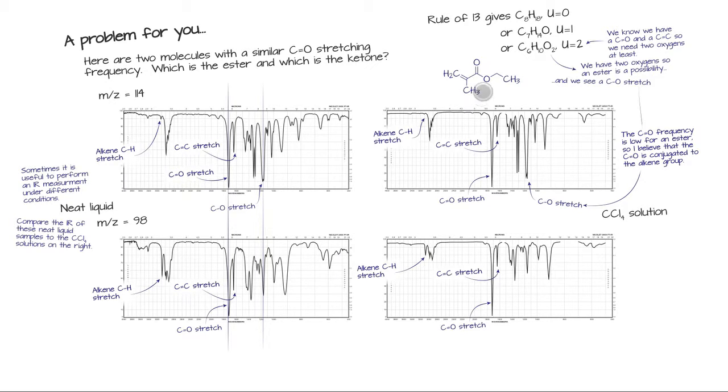Is the CH3 group here? Is it here? Well, we could look at bending vibrations in this neighborhood. We can look at the relative strength of that, and you could sort that out. But I'm pretty sure that there's a double bond conjugated with an ester. Are the alkyl carbons in the right place? Only NMR is going to tell for sure, in my opinion. But if you look at this in detail, you can back up the idea that it is a geminal substituted double bond.